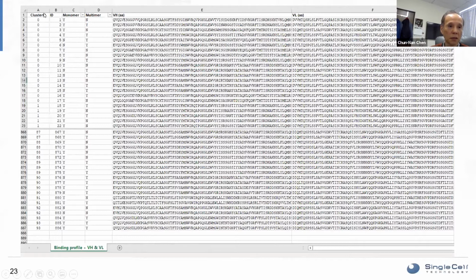So here is the cluster ID I mentioned. So remember the zeros. That means that these antibodies don't look anything like the other antibodies here. And you have these numbers here. So apparently they have up to 93 different families here, that are related sequences.